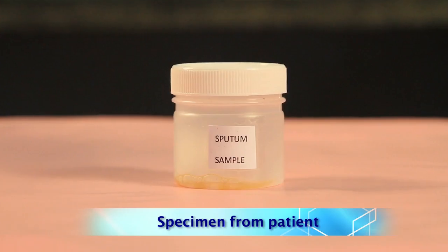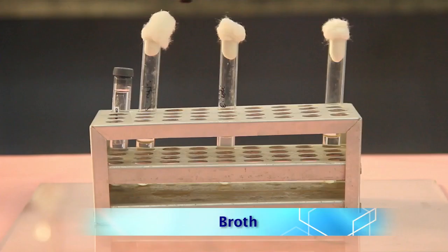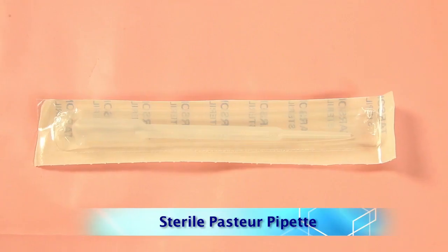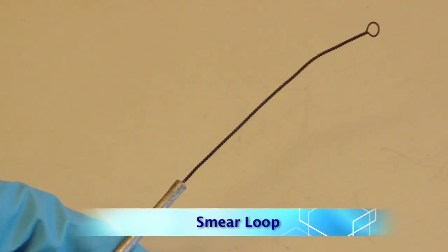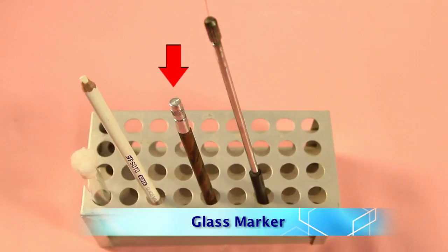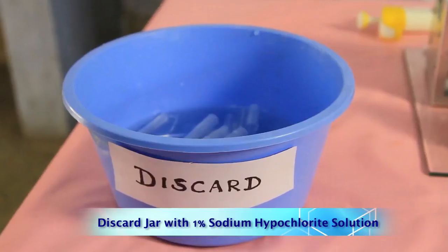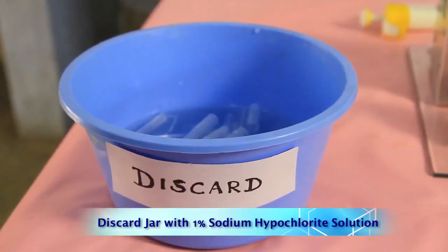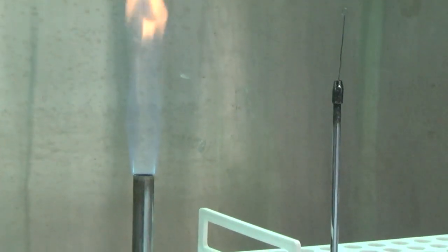Requirements: patient sample, culture plate with growth or broth culture, dropper or pipette, sterile inoculating loops, clean, dry, grease-free slides, glass marker pen or pencil, discard jar with 1% sodium hypochlorite, biosafety hood, Bunsen burner.